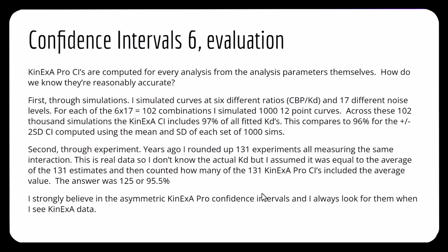And then I counted how many of the 131 KinExA Pro confidence intervals included the average value, and the answer was 95.5%. I did the same thing. I went back to that data and I sampled it with 3 random points, and I did that 100 times, I think. And I looked at that, and again, 95%.